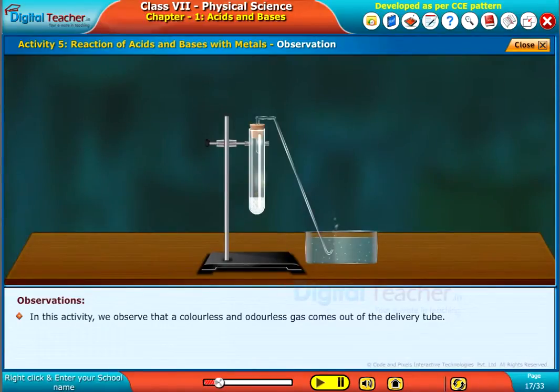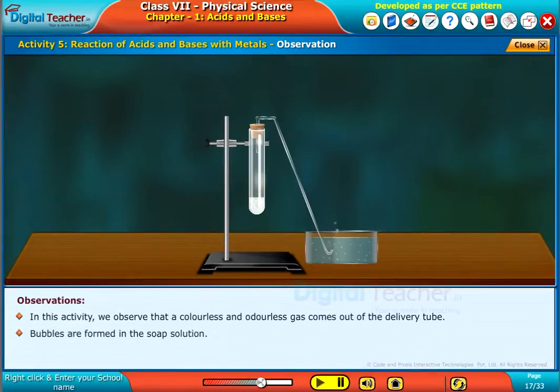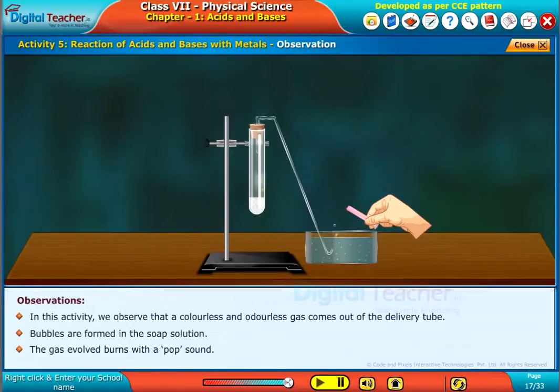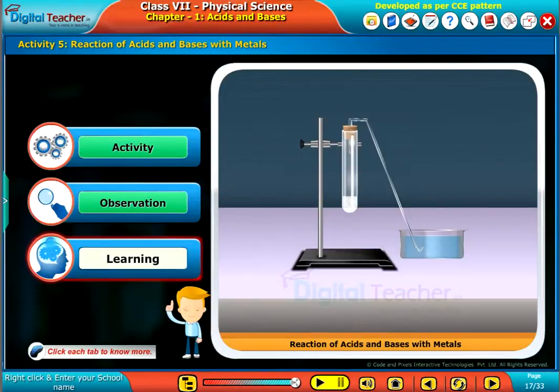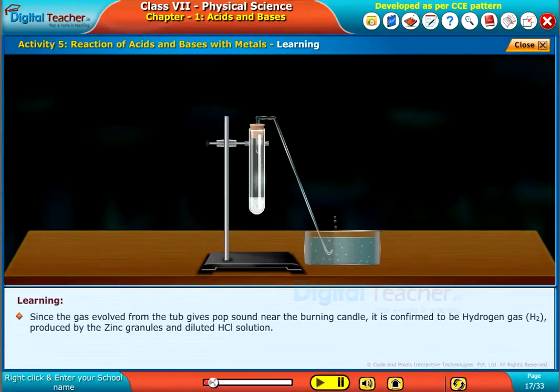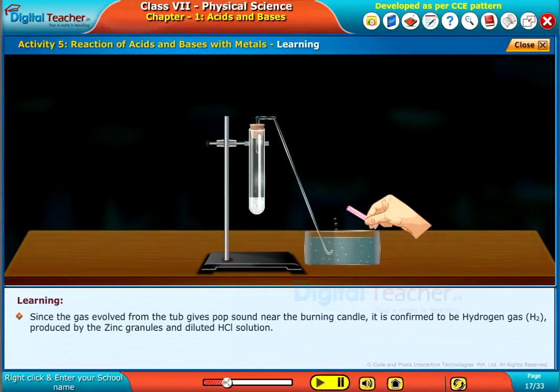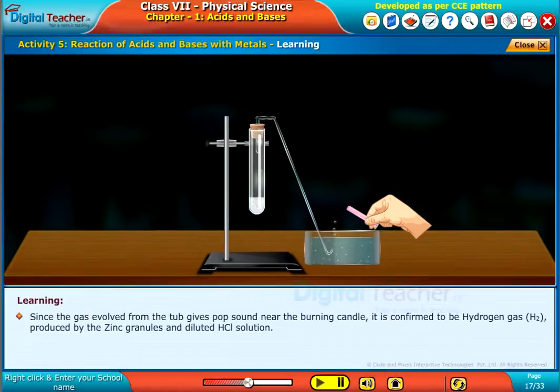In this activity, we observe that a colorless and odorless gas comes out of the delivery tube. Bubbles are formed in the soap solution. The gas evolved from the tub gives a pop sound near the burning candle. It is confirmed to be hydrogen gas, H₂, produced by the zinc granules and diluted HCl solution.